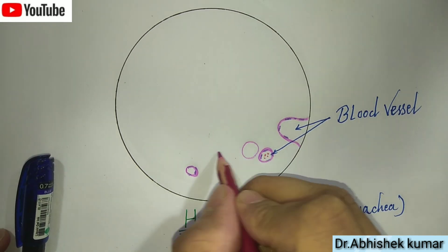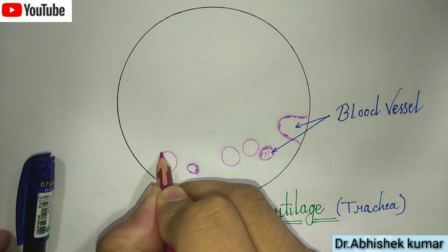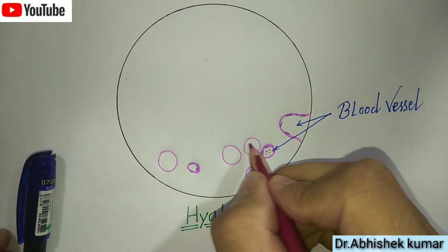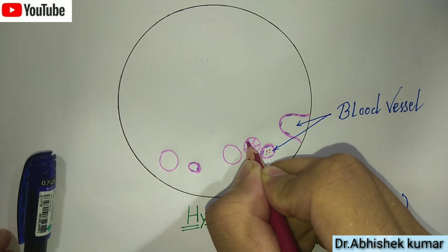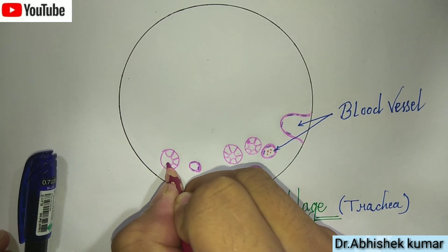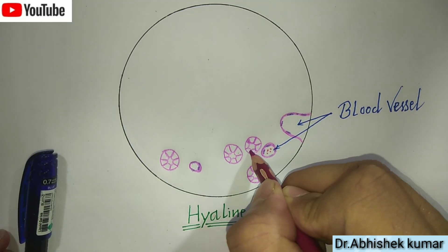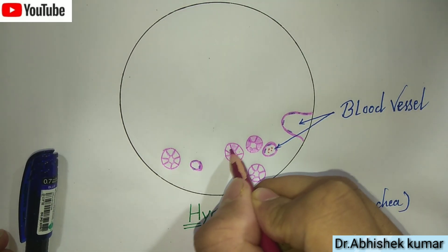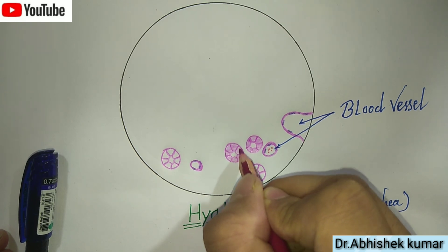Here we can see the presence of blood vessel. The cartilage is classified as specialized connective tissue.